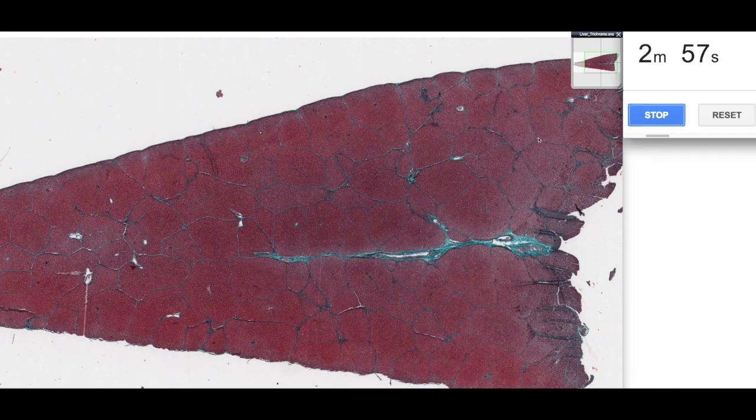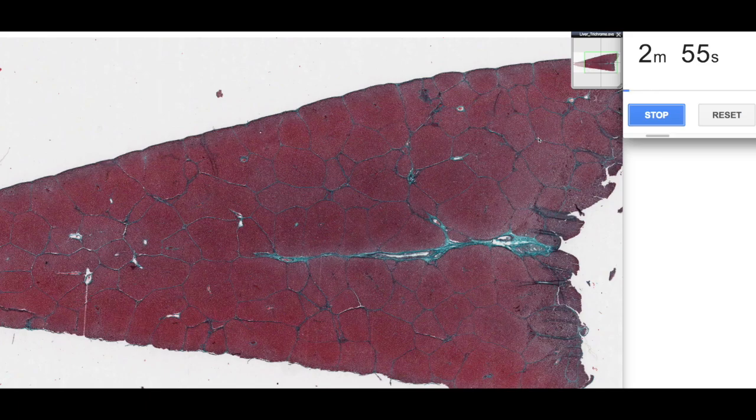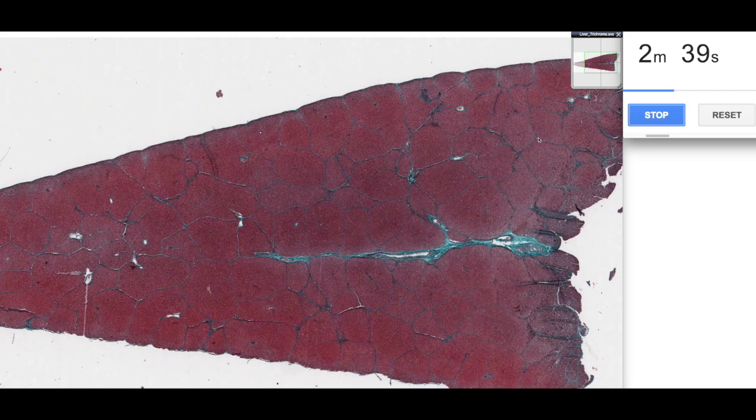So what I've done is I've taken this trichrome stain section because it really highlights the classic features of the histologist's understanding of the structure of the liver. In here, green or blue is the connective tissue fibers, so the collagen and elastic fibers, and the red is the more functional cells, the parenchyma of the liver.